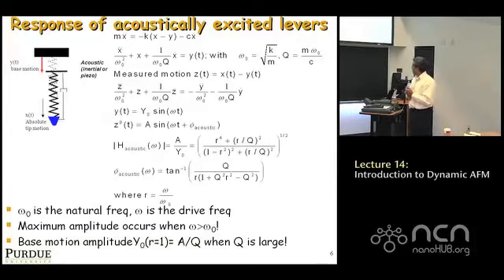Okay, a very, very important result is that if you choose r equal to 1, which is your drive frequency equals the natural frequency, if you do that, you find that... let's see, how does that work out? If r equals 1, then, correct. If r equals 1, you have 1 plus (1 over Q) the whole squared divided by (1 over Q) the whole squared. Okay, let me just think about that for a second.